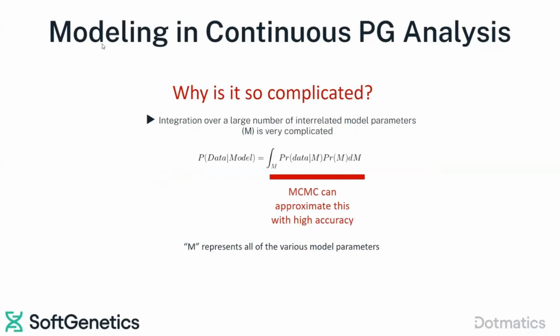So why is it complicated? Well, we're looking at thousands and thousands of different iterations. Remember, there were over 600 combinations just of the allele pairs when you were looking at 3 or 4 person mixtures. Then you get up to 5-person mixtures, of course, even more.